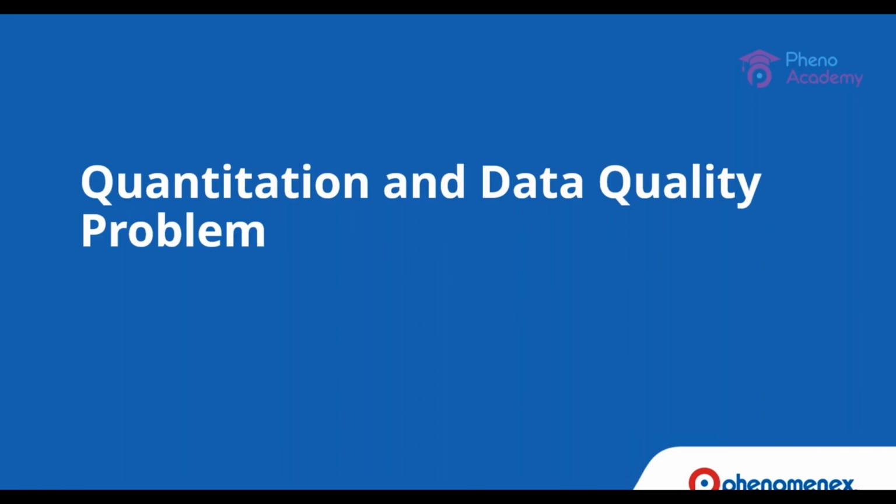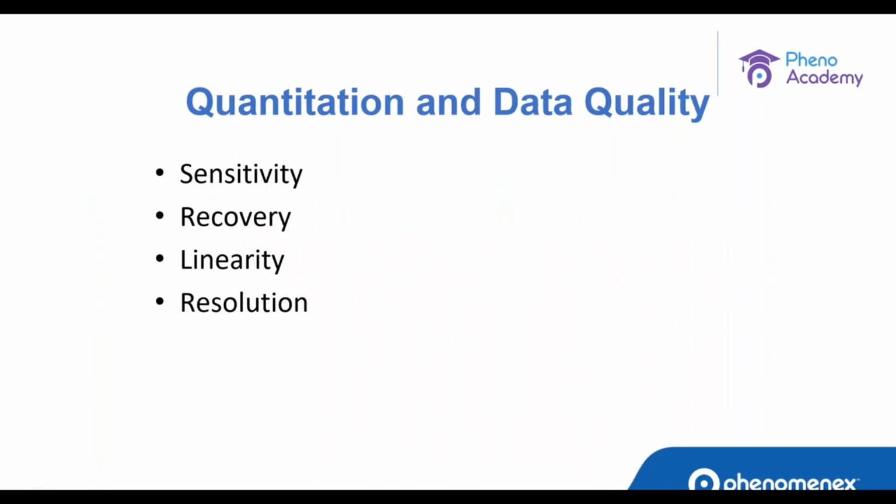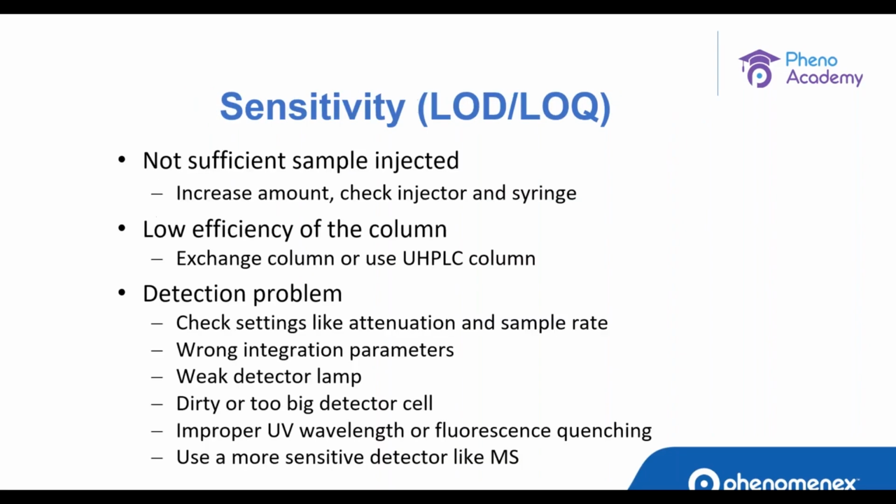Quantitation and data quality problems. For quantitation and data quality, we will focus on four different parts: sensitivity, recovery, linearity, and resolution.